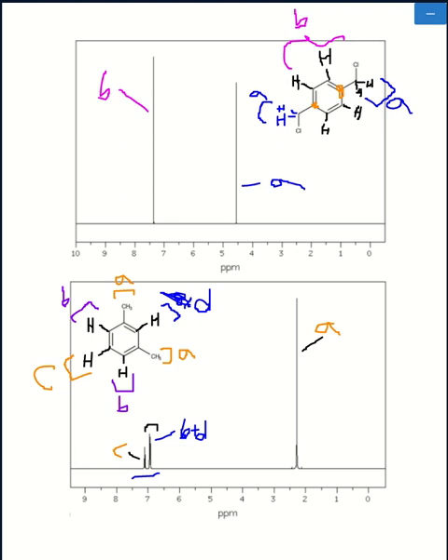Since it's the only one that is not connected to a carbon that's only one away from the methylated carbons, it would be the most likely candidate to show up by itself instead of overlapping with the other proton environments.